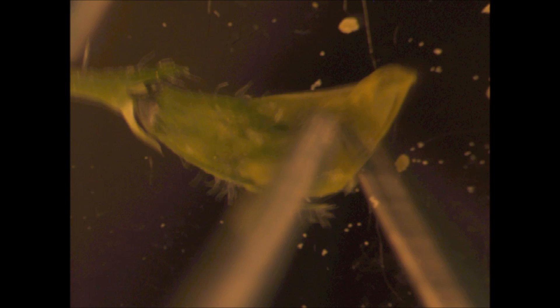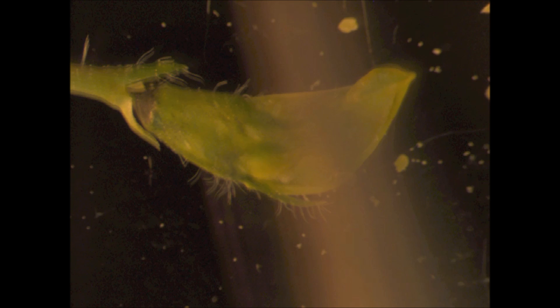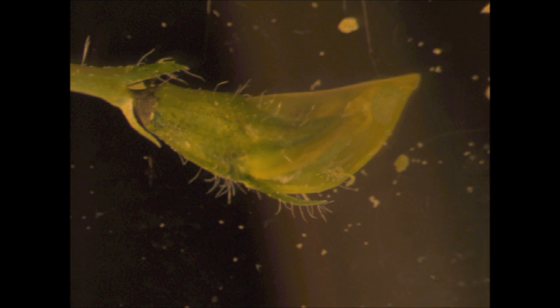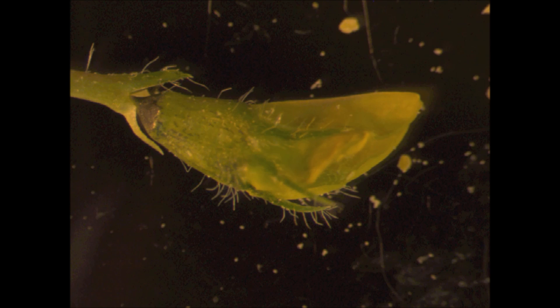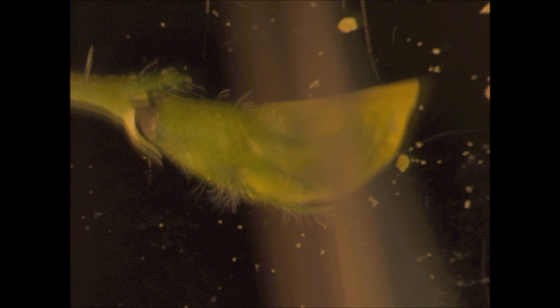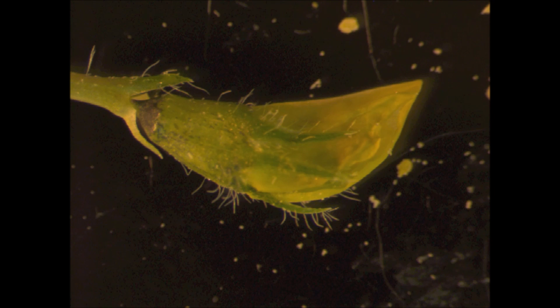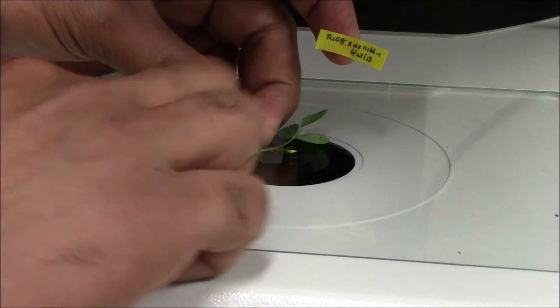After depositing ample pollen grains on the surface of the stigma of an emasculated female flower bud, close the flower bud by gently pushing and rubbing on top of the standard petal to cover the underlying wing petal, keel petal, and stigma completely. Flowers that are handled carefully and not damaged can easily close completely, forming a pouch around the stigma and looking similar to the unopened flower bud before genetic crossing. This pouch prevents pollen dislodging from the stigma during any mechanical movements and also protects the stigma and pollen from desiccation. After closing the flower bud, remove the cellophane tape that was placed under the flower bud gently.